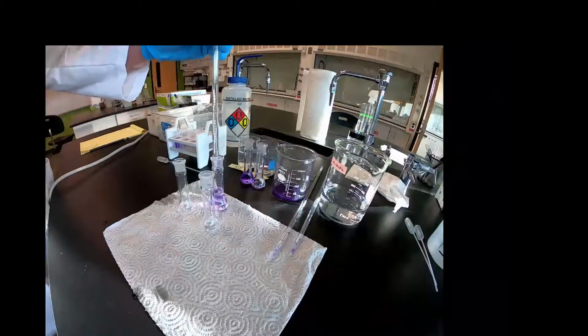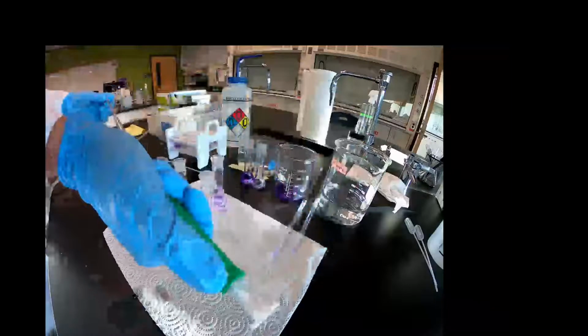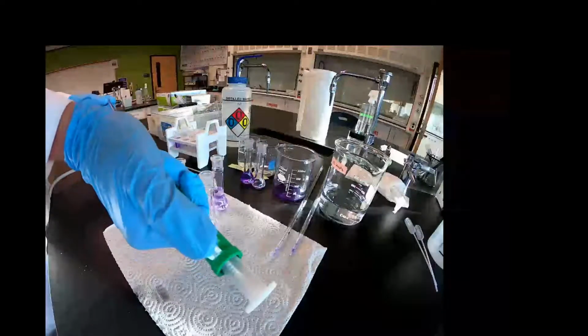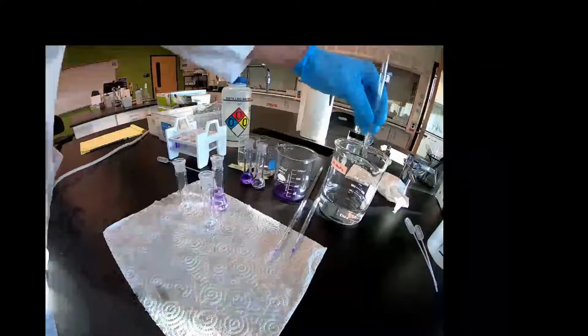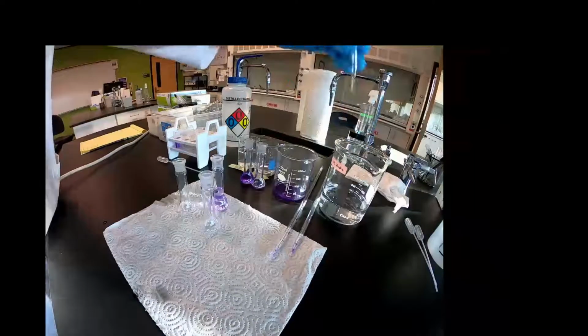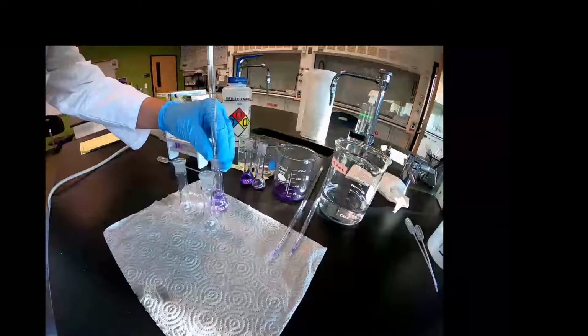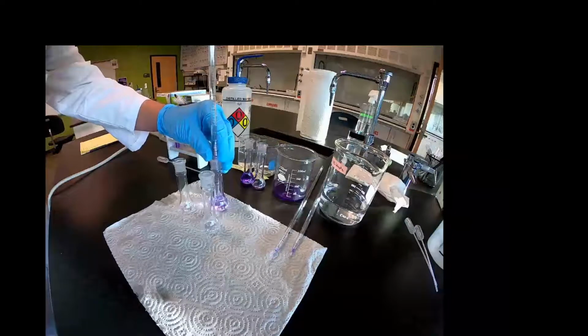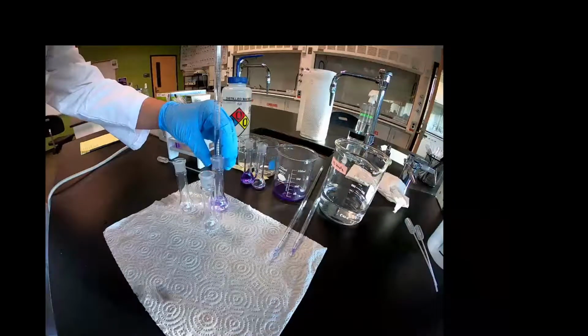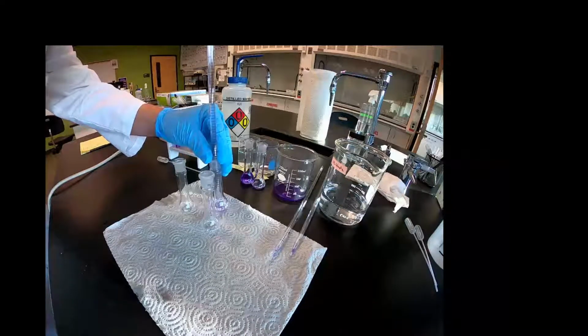So now we're back. What we're going to do again is make the dilution of the dilutions. Prepping the delivery vessel, the volumetric pipette. This is sample number 3 that we're prepping it with. Now we're going to take either the, let's see how much he draws up there. That's good. Looks like it might do them both, okay, at one shot. Draws a lot up there. It's very doable.